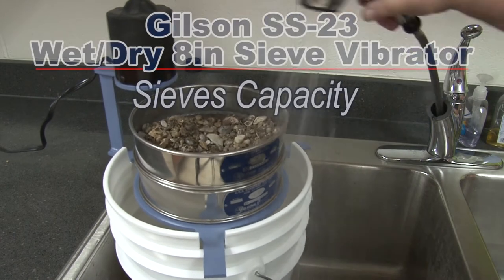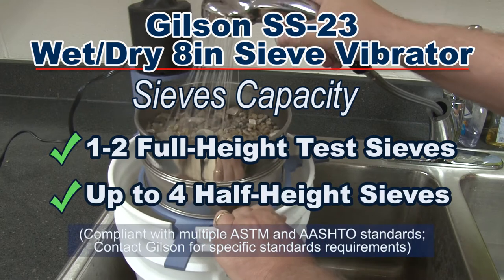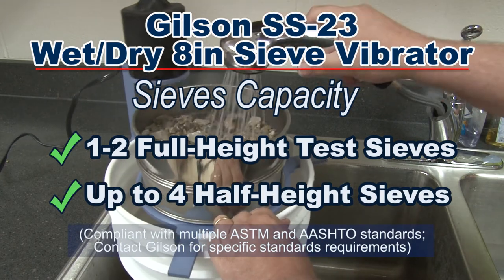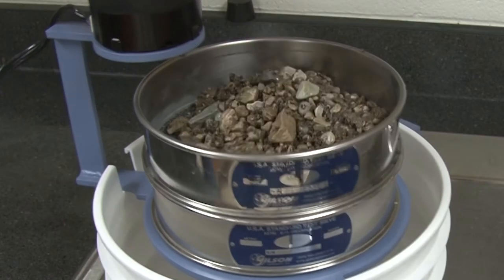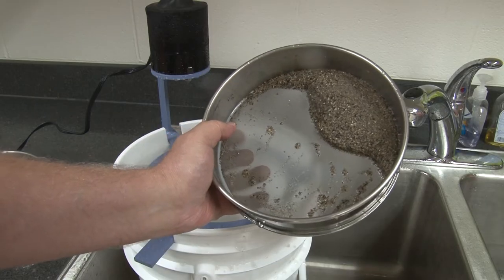The SS23 can be used with either one or two full-height or up to four half-height 8-inch ASTM test sieves. Vibration energy is transferred directly to sieve frames, promoting passage of finer particles.